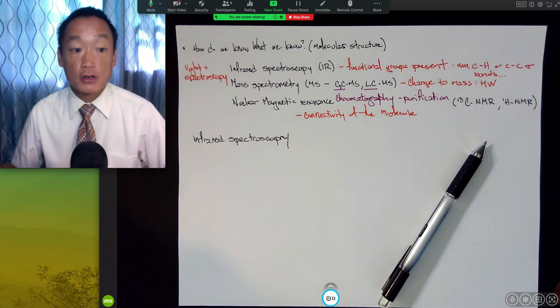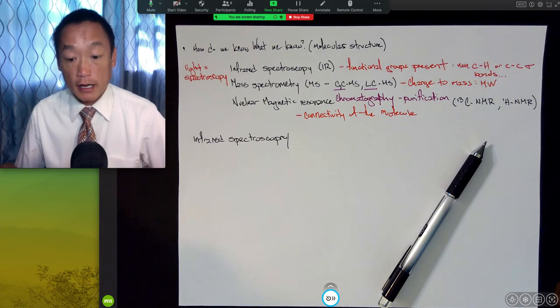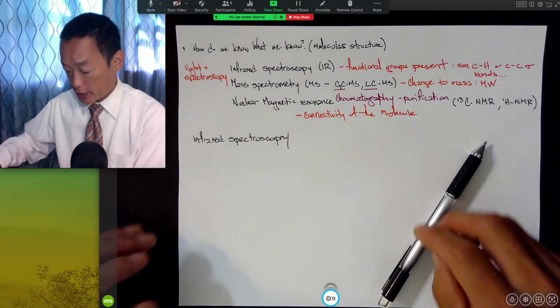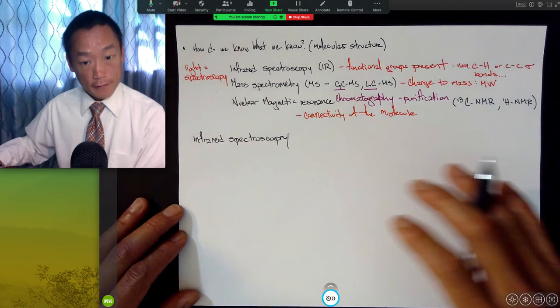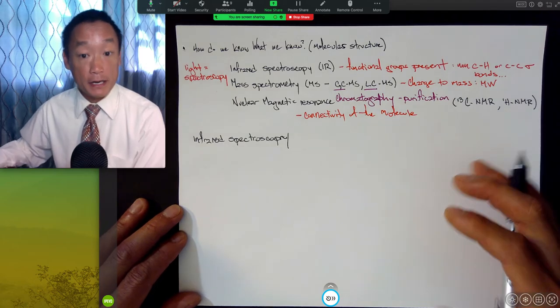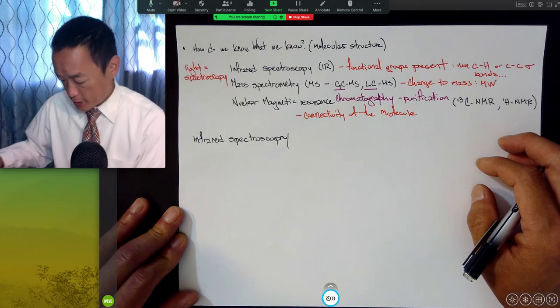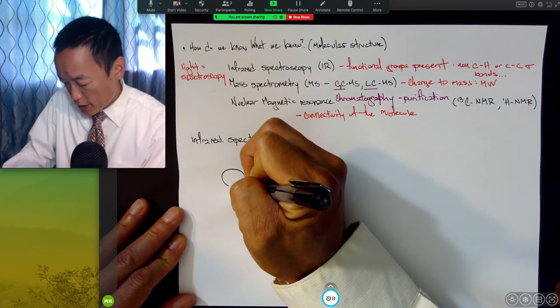And as a result, the energy of the bonds in that molecule can all be tuned and excited with this IR light. So what I'd like to do here is first sketch out the schematic of this and talk about what's happening inside an instrument. The schematic is such that you have really a light bulb.